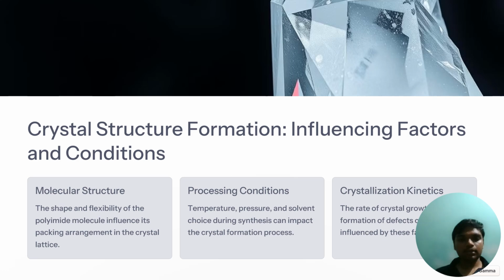One of the main challenges in X-ray crystallography is solving the phase problem, which refers to the fact that the diffraction pattern only gives information about the intensity of the diffracted rays, not their phases. The phases are crucial for determining the exact positions of atoms in the crystal.